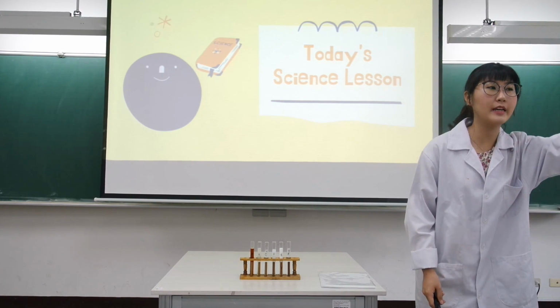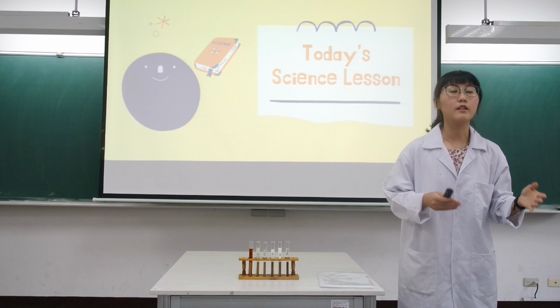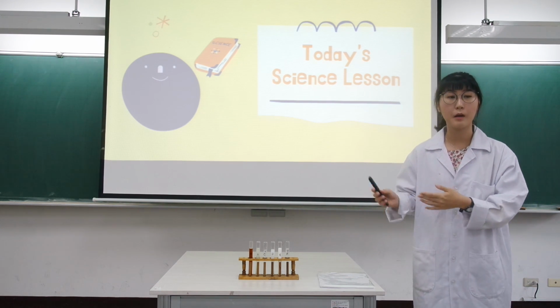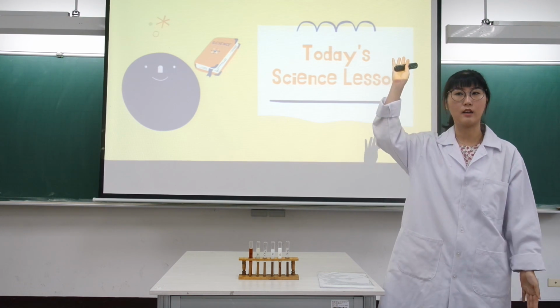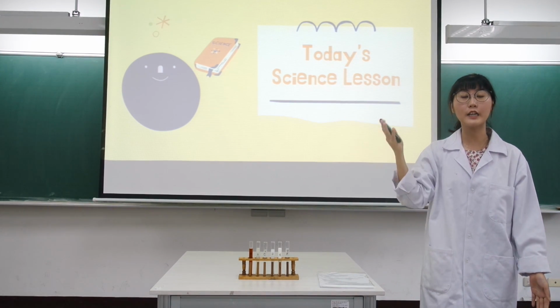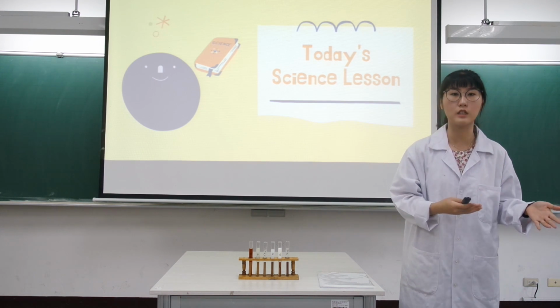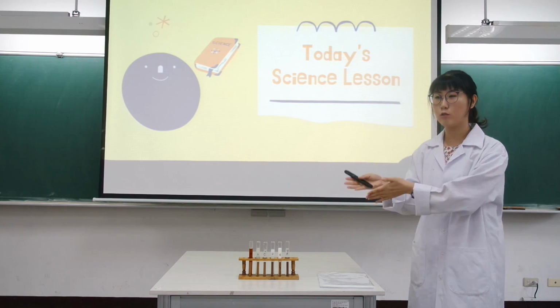So who can tell me what we did in last class? Okay. Tom, can you tell me? Oh, Tom said 我们用了石蕊试纸 so we used the litmus paper. But we used the litmus paper to do what? Who can tell me? William? Okay. 测溶液的酸碱. Very good. So we use the litmus paper to know the solution if it's acidic, basic, or neutral.